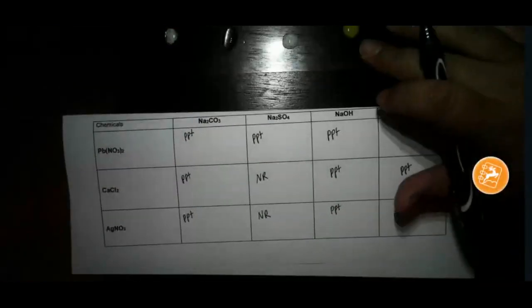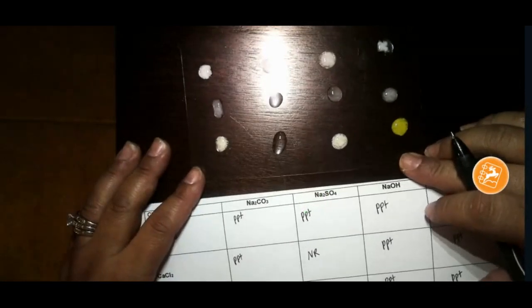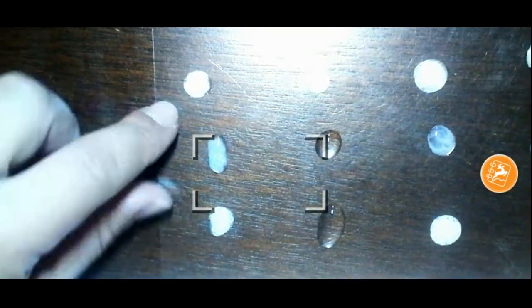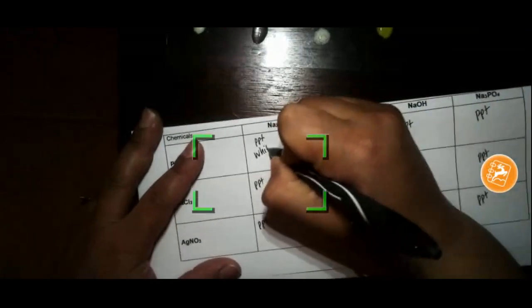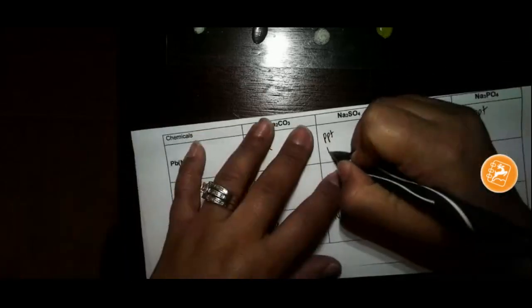That is when a solid forms, because 2 aqueous solutions have combined, but a solid forms, and you can see the solid sheet. So now I would definitely say that these are all white. All these are white, white, white, white, but this one's yellow. So we're going to go ahead now and record the colors. No reaction for these.